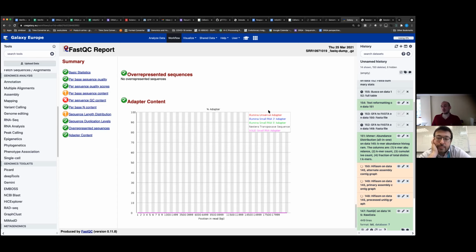But the best way is actually to update the internal FastQC library so that it also checks for adapters from HiFi reads, and so you can see if they occur in this data or not. So at this step, the adapter sequences were clipped already? Yes, PacBio should in principle remove them when the output is generated, so they provide you adapter-free sequences.